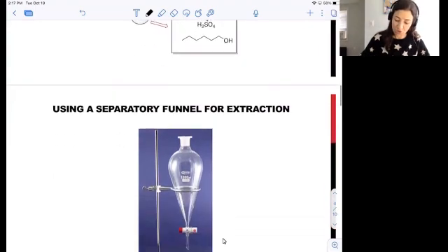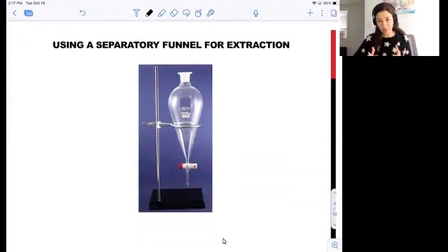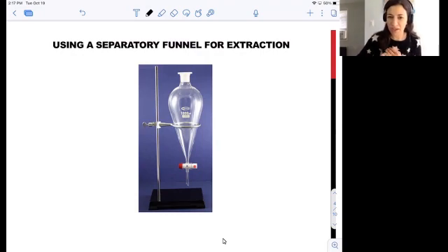When our reaction is over, in addition to these organic products that we're so interested in, it's likely that we will have an excess of ammonium bromide and chloride salts, and we're still going to have sulfuric acid present. These species are not compatible with the analysis we want to do on our product mixture, which will include infrared spectroscopy and the use of a gas chromatography very small column. In order to remove these salts and acids, we use a separatory funnel, which is shown here.